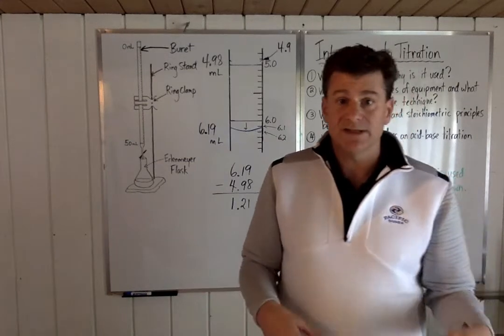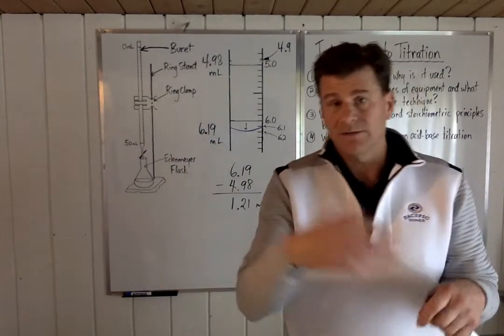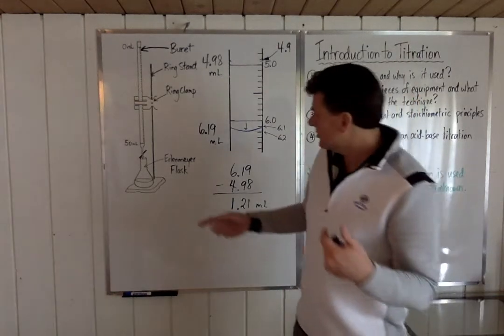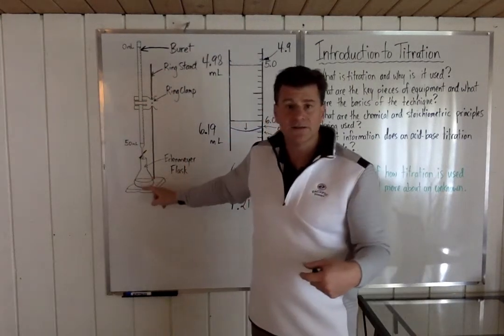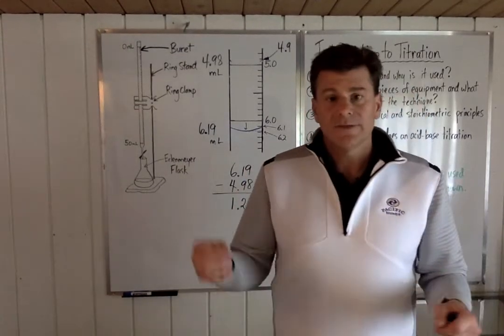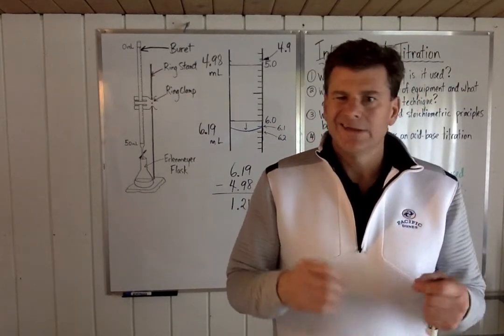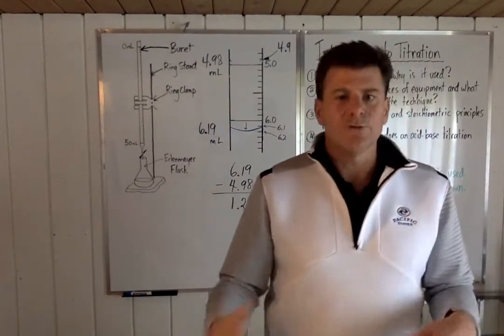Now, for titration, which is an interesting thing, and we're going to do this one later, you can put a pH probe in as well. And every single time you add in half a milliliter, a milliliter, whatever it would be, depending on how precise you want your graph to be, you can actually graph the changes in pH over time. So let's pretend I started with acid down here, and I've got my base up in here. If you take the pH meter and put it into the Erlenmeyer flask, and you're recording, initially it's going to be super acidic, obviously, because it's all acid, so it's going to have a low pH. Then you add one little bit of base. Well, one little bit of base isn't going to neutralize it totally, but it's going to make it slightly less acidic. And so the pH might go up a fraction, just a little bit, but it's still going to be acidic. And it will keep being acidic until you start to slowly eat away the acid.